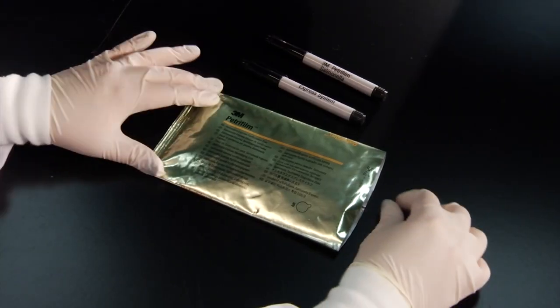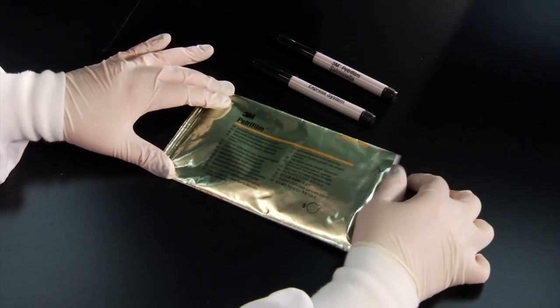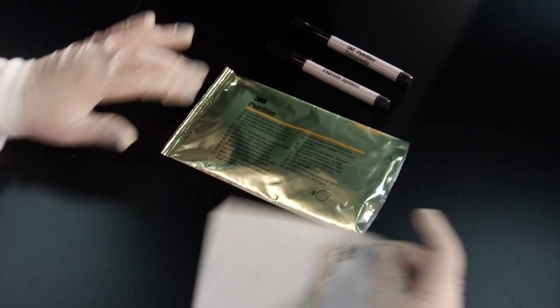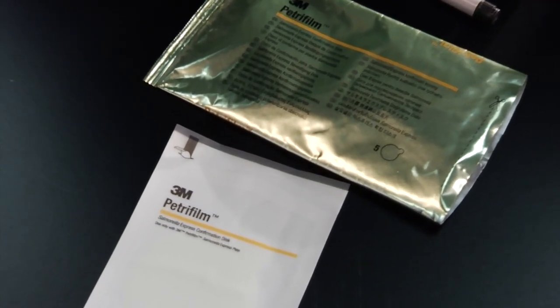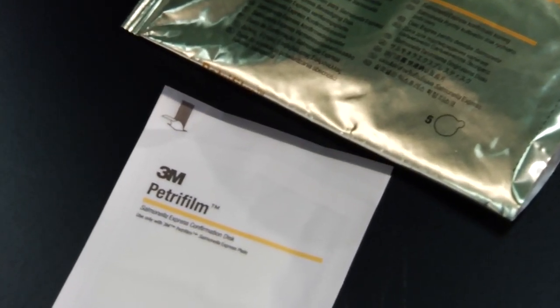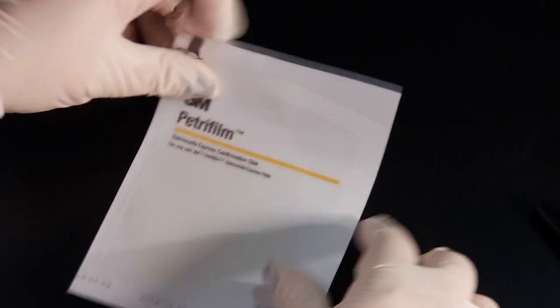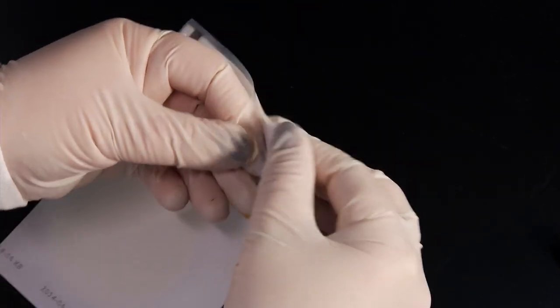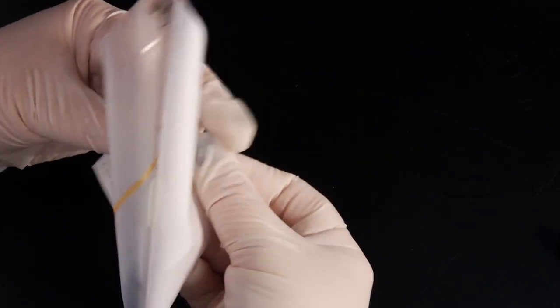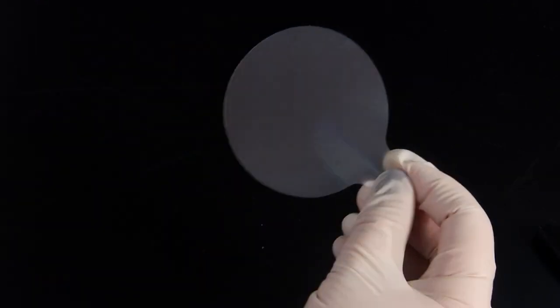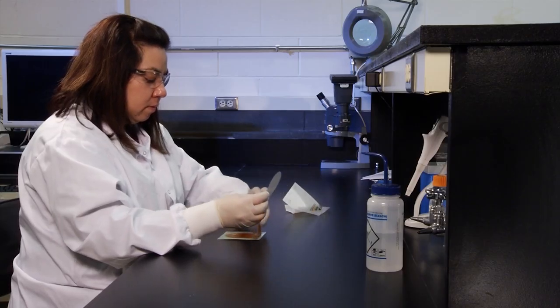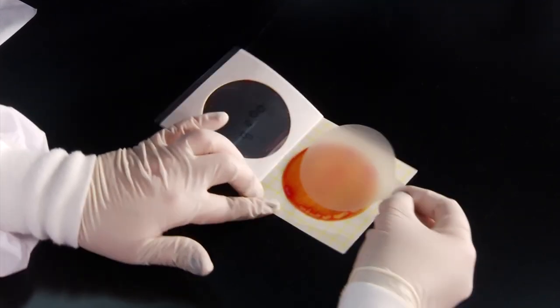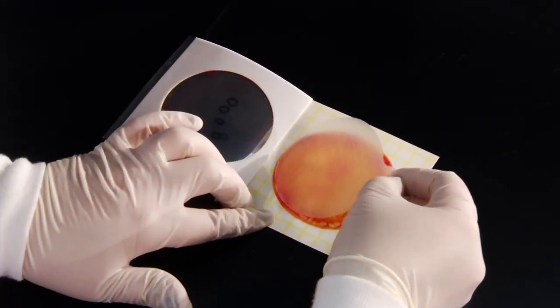To begin biochemical confirmation, remove an individually packaged 3M PetriFilm Salmonella Express Confirmation Disc from its pouch and allow it to come to room temperature. Peel the package to expose the disc's tab. Grasp the tab and remove the disc. Insert the disc by rolling it onto the gel so that you avoid entrapping air bubbles. Then close the plate.